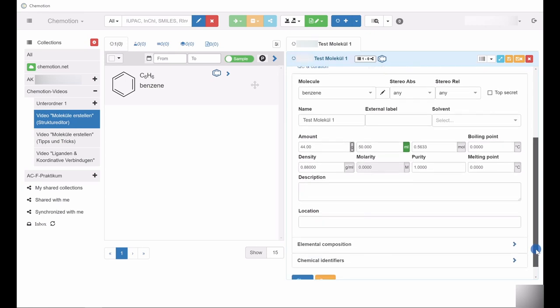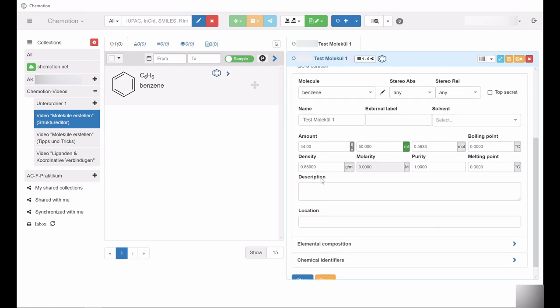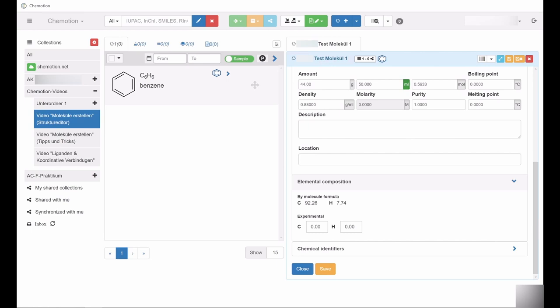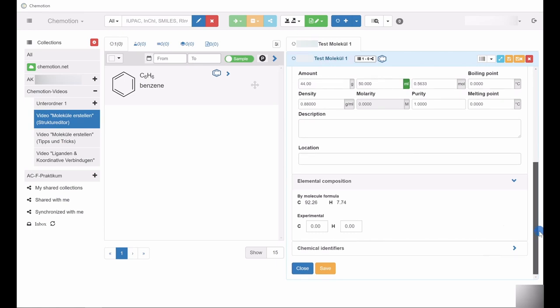If you scroll down further, you will see fields where you can enter a detailed description as well as information on where the chemical compound is physically stored. Chemotion calculates the theoretical composition and displays this information in the Elemental Composition section. You can also enter the experimental results of an elemental analysis.